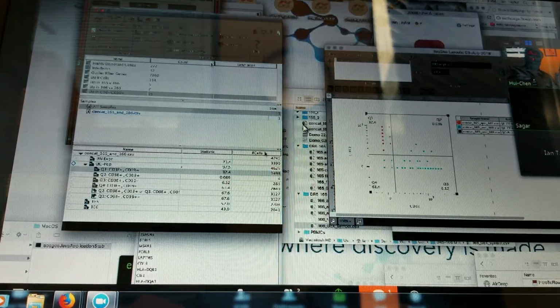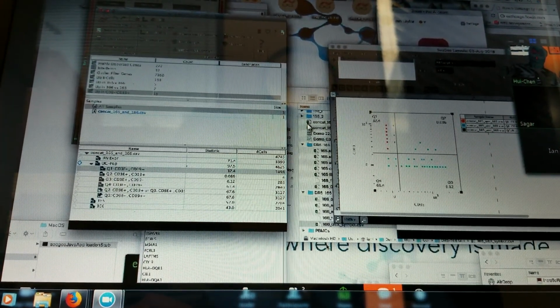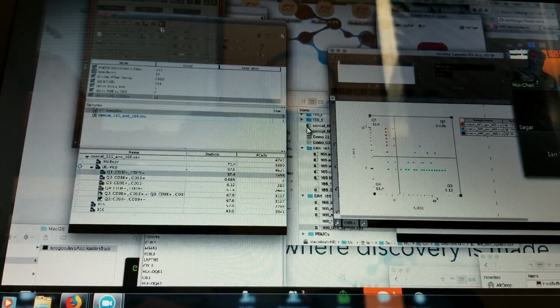Now, are you gating on clusters of VDJs? No, not yet. Oh, okay. I'm sorry. I just want to arrive at something for us to do a comparison. Okay, right. Okay, good idea.